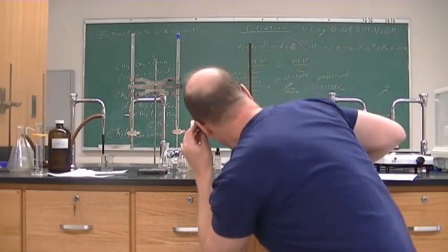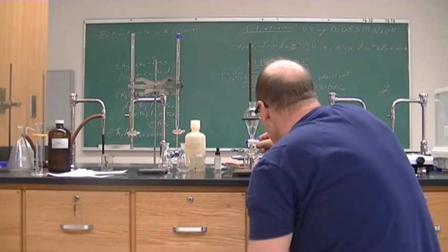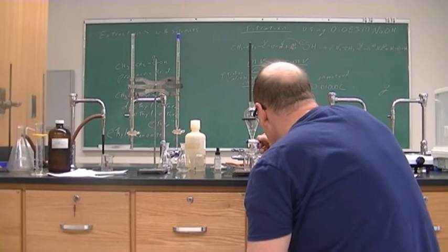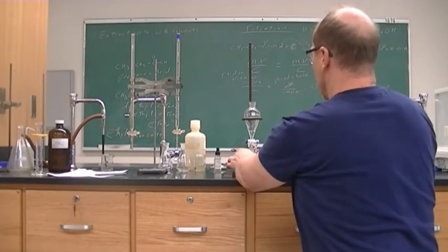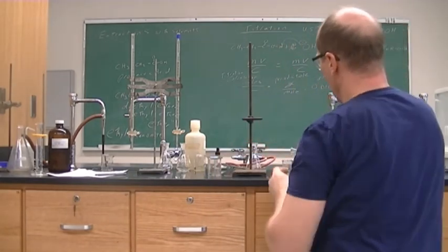So I'm going to take out the water. I put the ether into the ether waste.